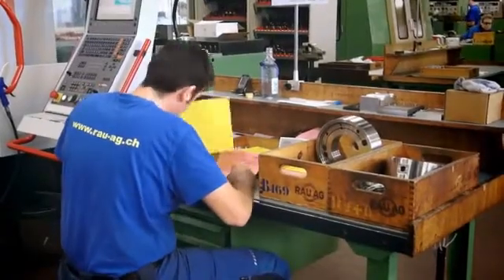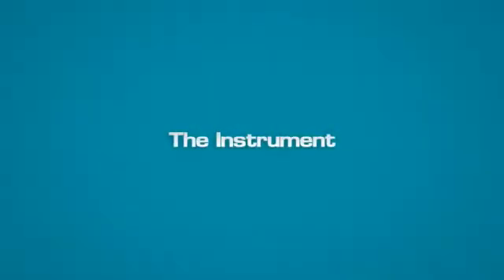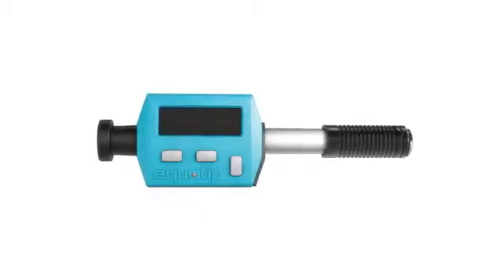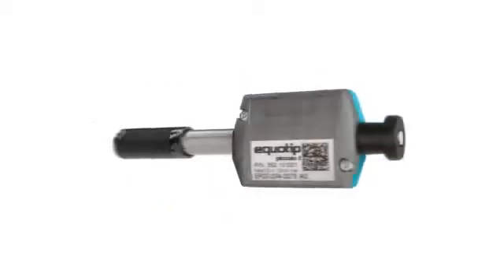These are the different parts and functions of the instrument.